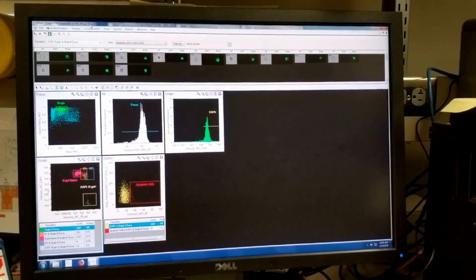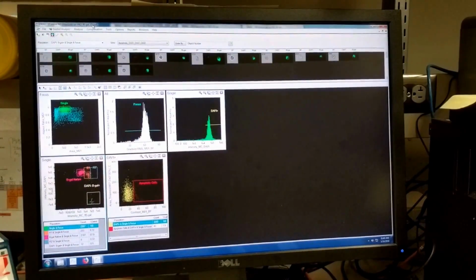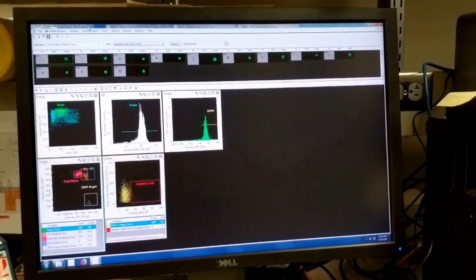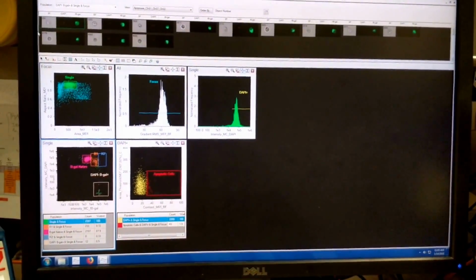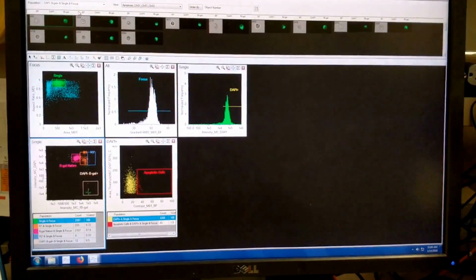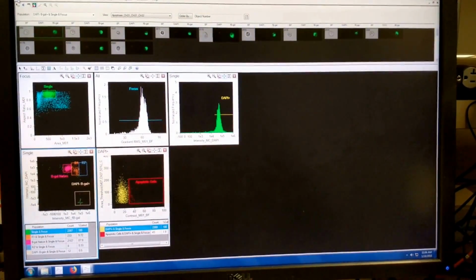We didn't know what doses to start with. So Xiaojun just took 10, 20 and 40 of etoposide doses, and she then added fluorescent beta gal, and then I took over and I treated the cells, and I did the flow experiment on Saturday the 13th of January. So here is the analysis part of it. If you look at overall, you kind of are disappointed that there is no major change, but then I started really teasing down onto what are good cells versus what are bad cells, and these are some of the observations I have.